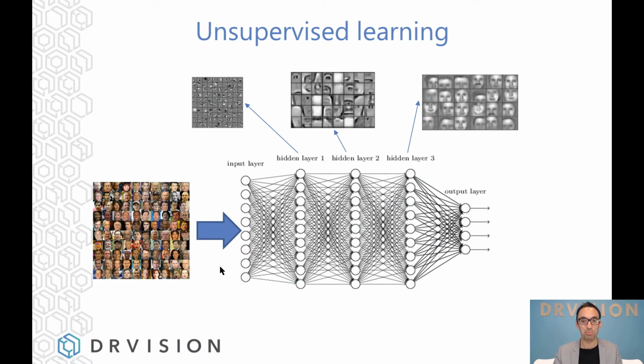In an unsupervised model, you would start with a network of some sort, which can have different architectures. You feed in lots of images, and the first layer, the first hidden layer, normally there's more than two in order for it to be considered a deep network, can identify small features through convolution with a filter that goes through the whole image in detail.